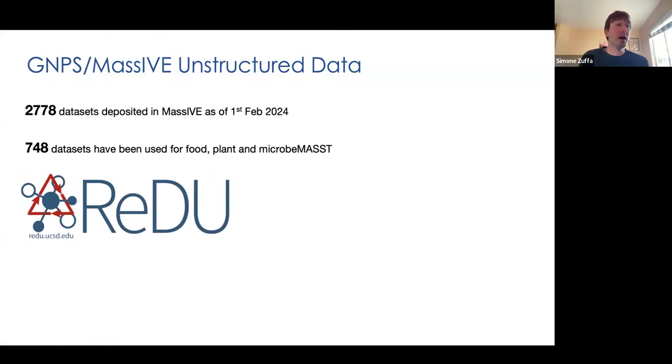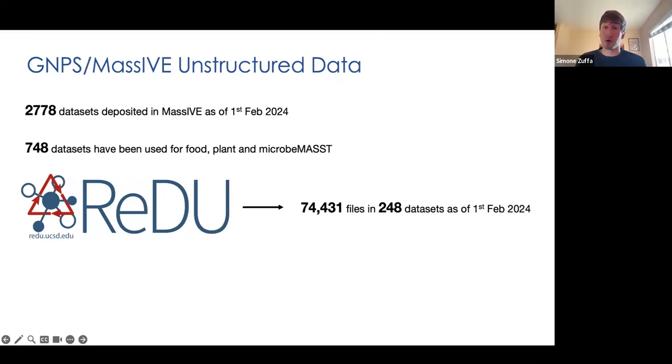As I mentioned before, we have ReDU, a very powerful tool that allows you to associate metadata to the samples that you have deposited. And on ReDU at the moment, we have 75,000 files coming from almost 250 unique datasets.